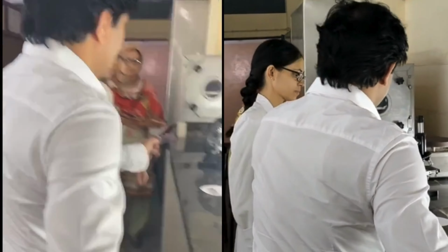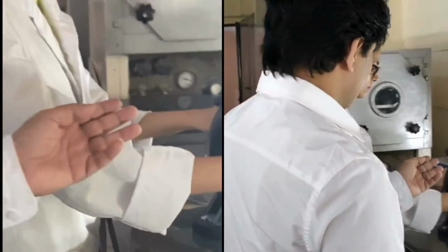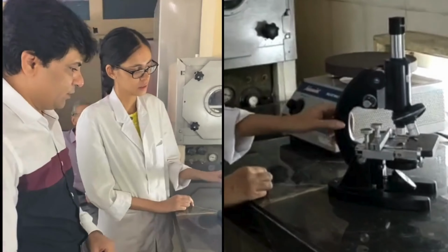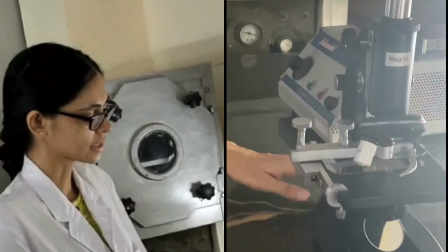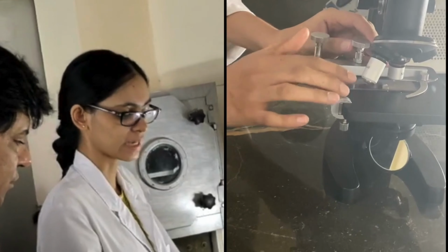So this is the compound light microscope, and here we have 5x, 10x, and 40x magnification. Tell me something about different parts of the microscope fast. So this is the stage, and these are the adjustments for the stage. This is where we keep the slide.